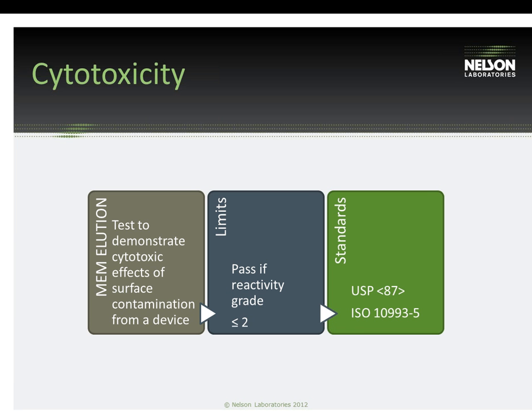So you can help justify that overall residue value with this test to show, I've got this amount of residue that I just quantified, but the residues are non-cytotoxic. That can help you say that you have a clean device. And so we always recommend including the cytotoxicity test as part of the validation for this purpose.